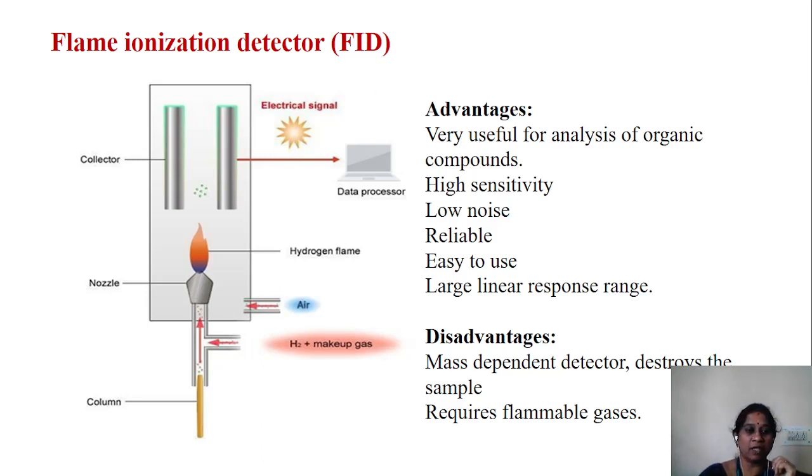There you have a flame jet. Can you see here, this is a flame jet. This flame jet acts as one electrode, and this collector acts as another electrode.